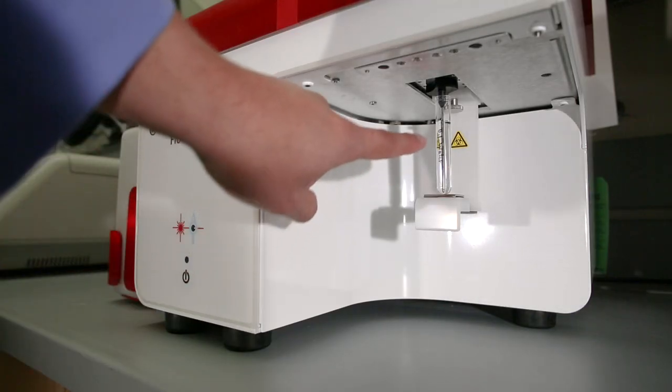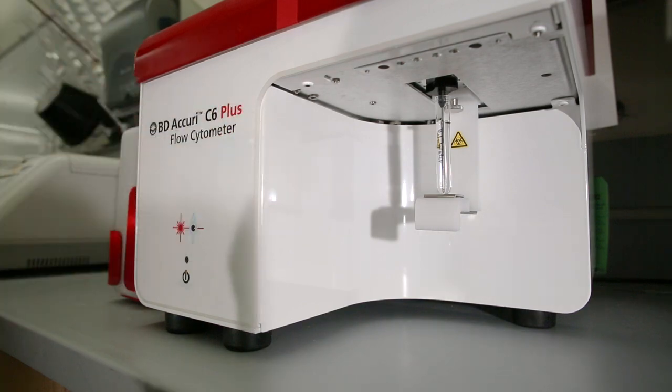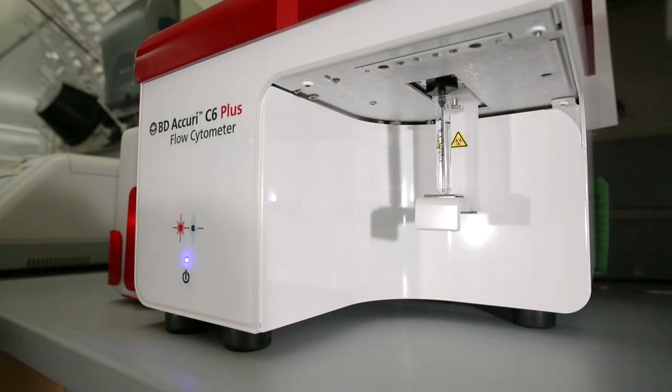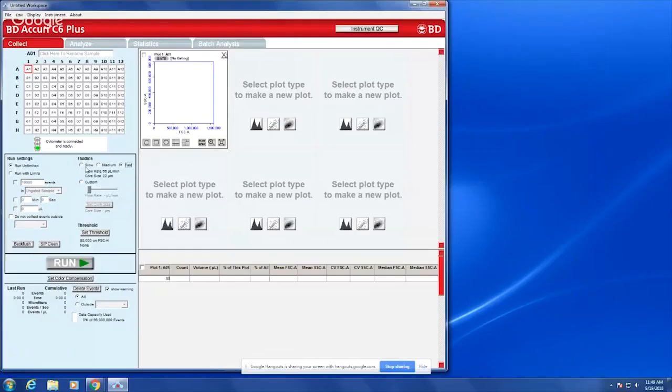To start up the cytometer, first check that there are at least two milliliters of water in the sip. Push the power button and wait. It will take the machine about 15 minutes to start up.